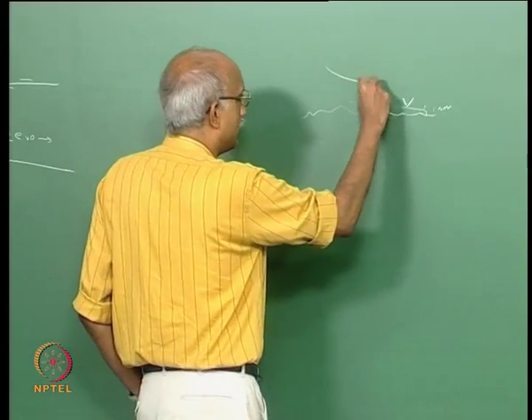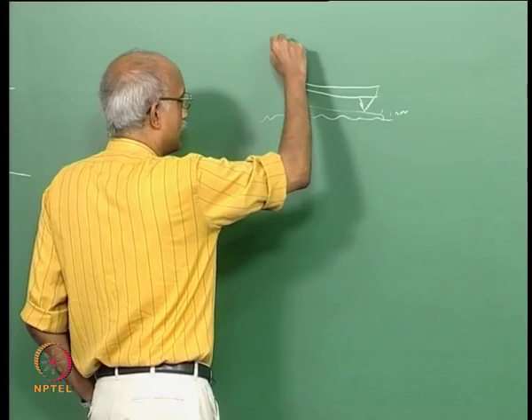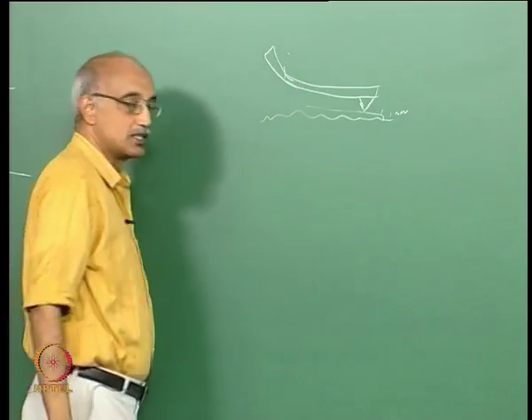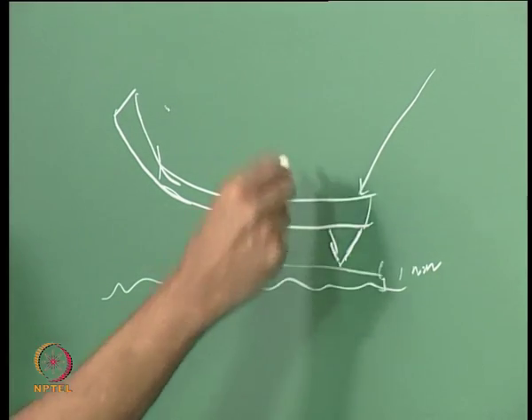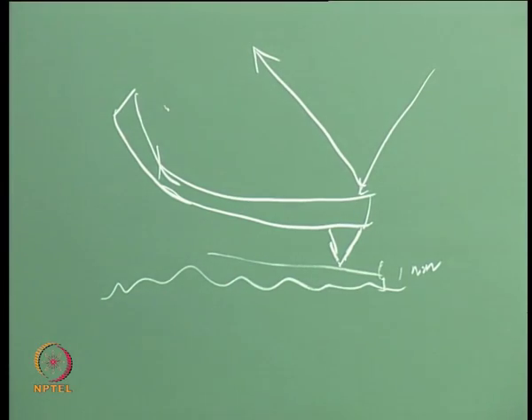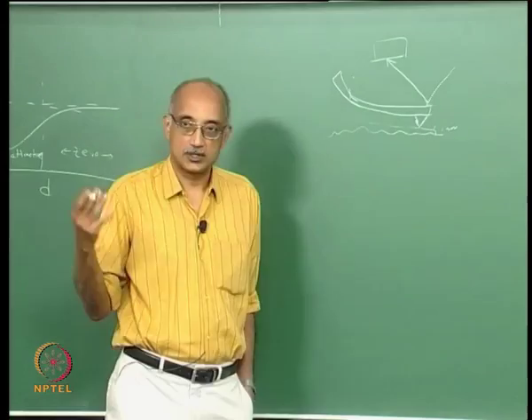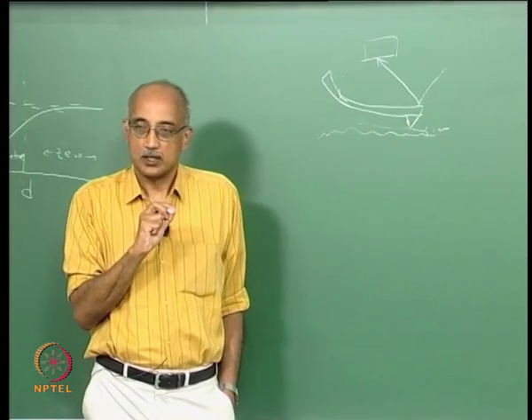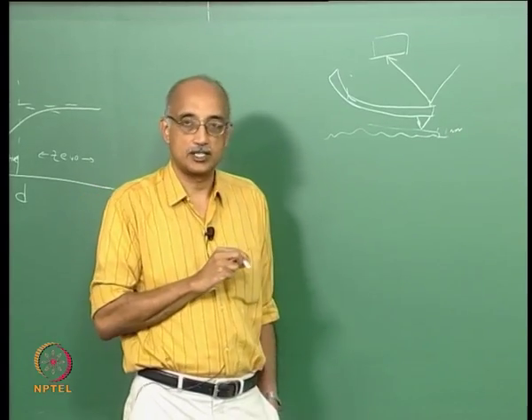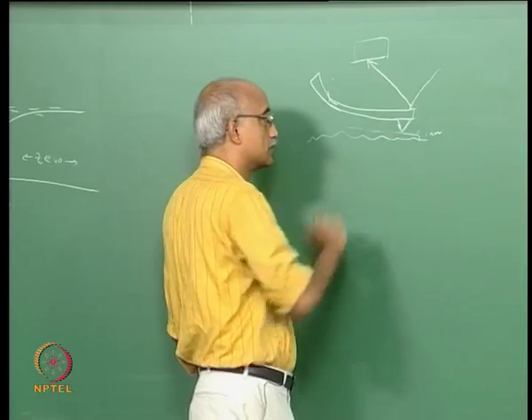So if this tip can be made to ride on what's known as a diving board shaped, actually it looks more like this, cantilever, and suppose we shine a laser light here. Now what's going to happen is that laser light will be reflected and captured, and you can have a photomultiplier which can take this signal and multiply it many times and give you a reading. So as this tip experiences a force, even the slightest deflection will be amplified many times because of the cantilever arrangement, and the change in the angle of the incident laser will also be changed by several orders of magnitude beyond what was measured as this force.